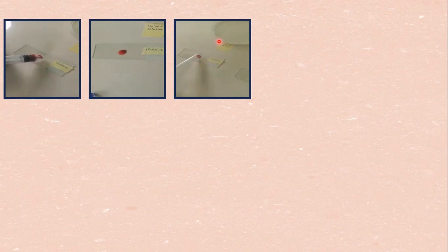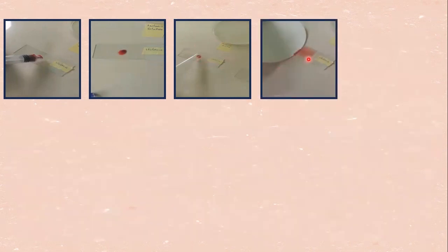Then the solution that is going to be put on the blood is added, and the rod is used to smear the blood onto the slide. Then a cover slip is dropped on it, and extra solution is absorbed with filter paper. So you have the slide prepared, and this microscope slide with the specimen on it can then be observed in the microscope. We discuss how this is done in our lesson on microscopes, which you should please check.